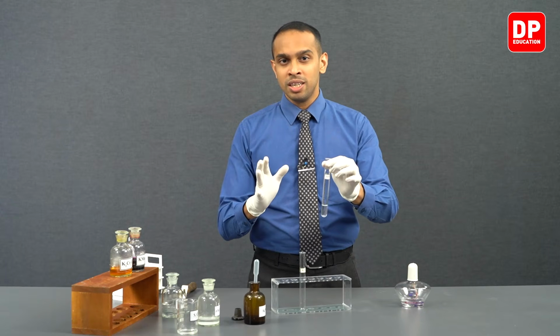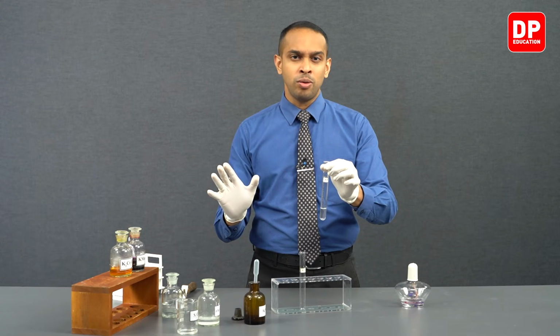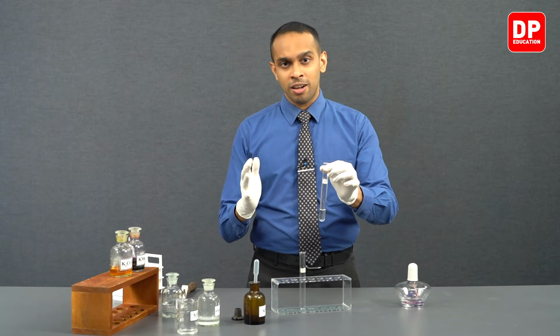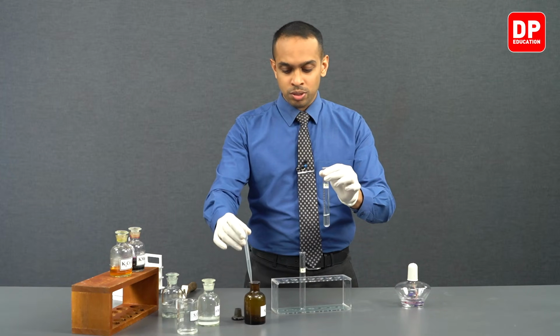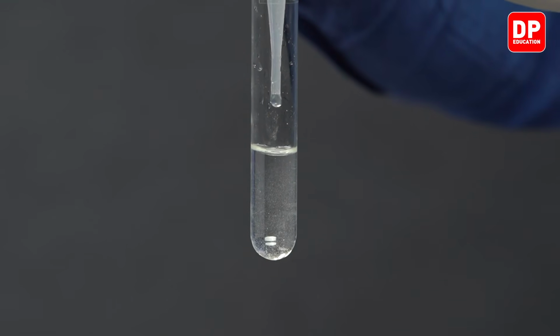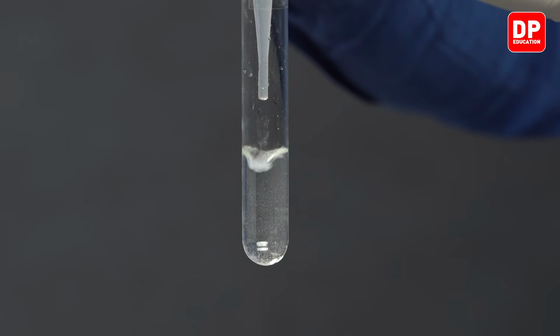So initially, a white color precipitate, silver thiosulfate, will be formed, which is unstable. It readily turns into silver sulfide. So as I introduce silver nitrate to this test tube, now students, let's observe what happens when we add silver nitrate.